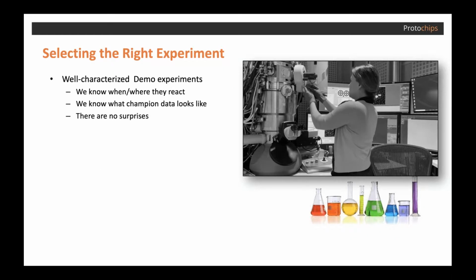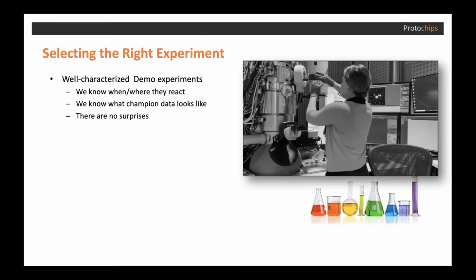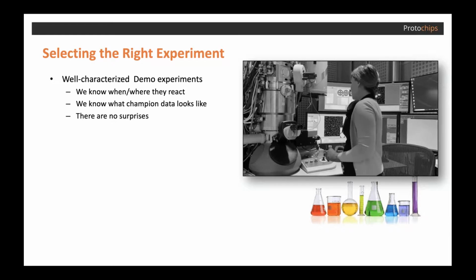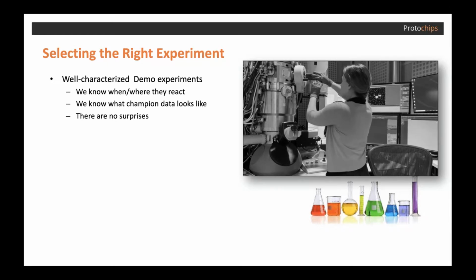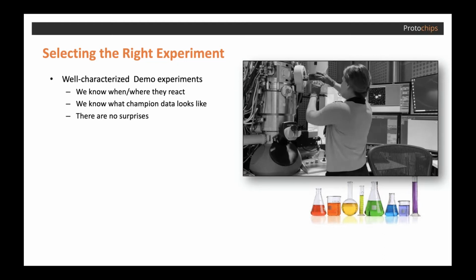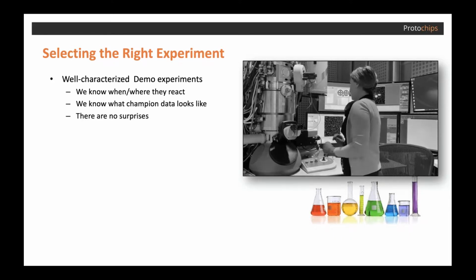So just like so many other manufacturers of scientific instruments, we have a regular need to demonstrate the capabilities for customers who are investigating them for purchase, or perhaps to train current customers on expert use of their new in-situ systems. And we chose one of these experiments since we know their behavior. We know when and where they will respond to the stimuli, what's the best data we would expect in the end, and perhaps most importantly, we know that they present us with no surprises.